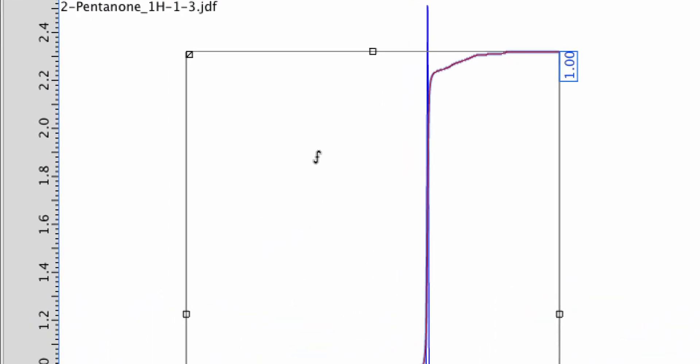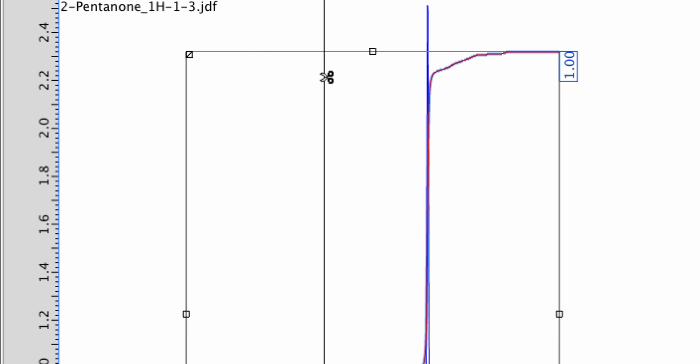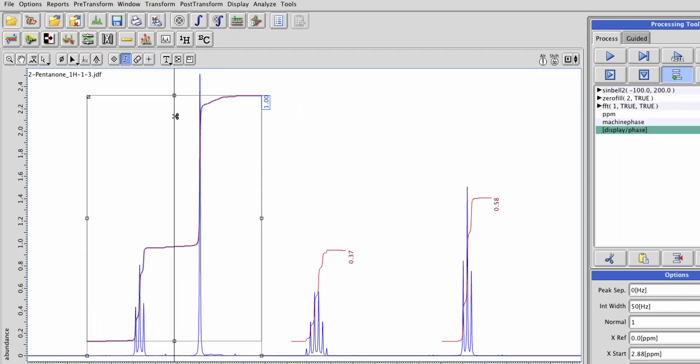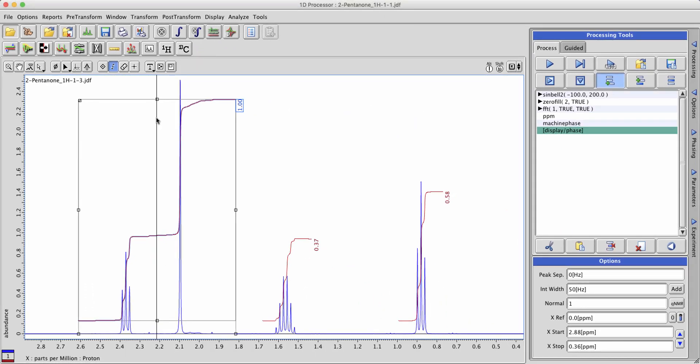If that's the case you can left-click and hold on the top left corner of the integral box here. Notice that the cursor changes to a set of scissors. When you click and hold and then release, the integral will be cut at that point into two separate integrals.